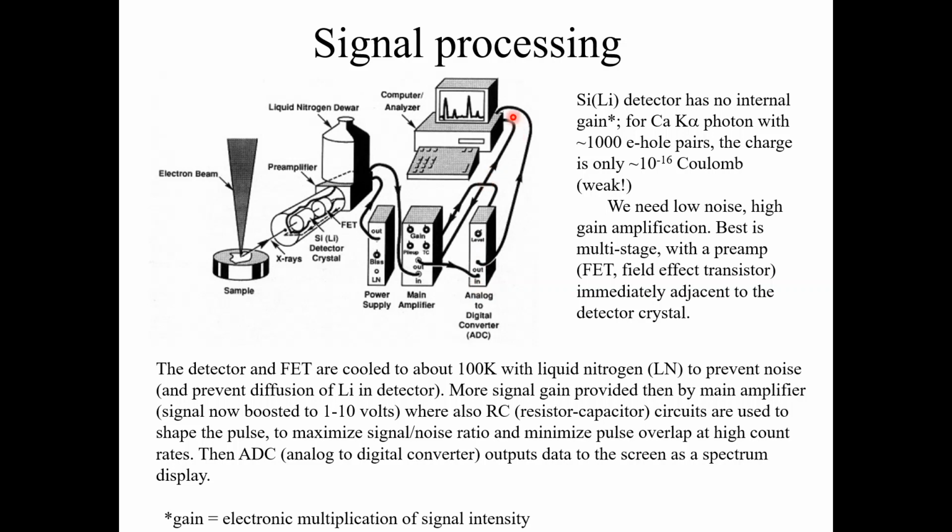Here you can see the process. We get the signal from the sample holder with the help of the silicon lithium detector.